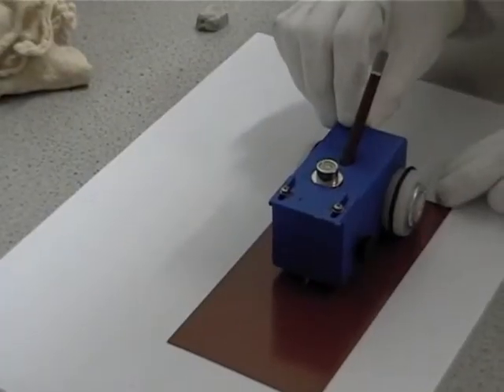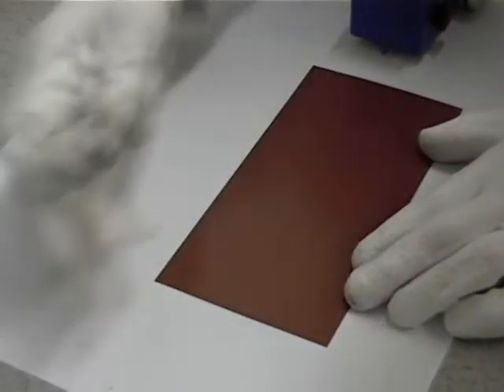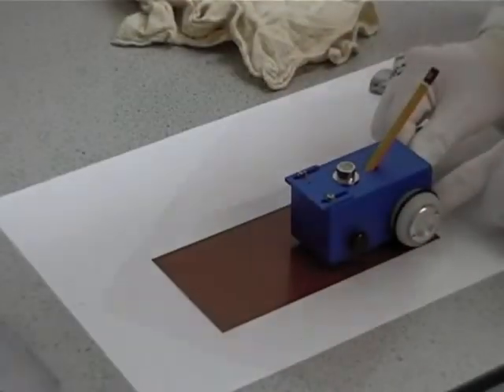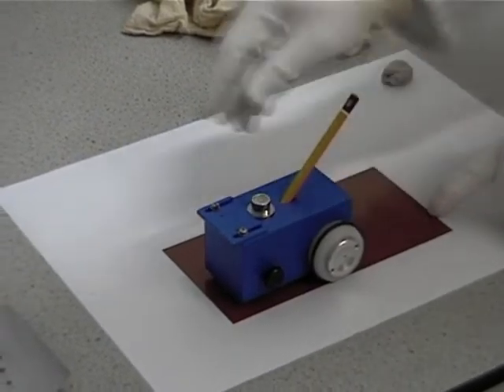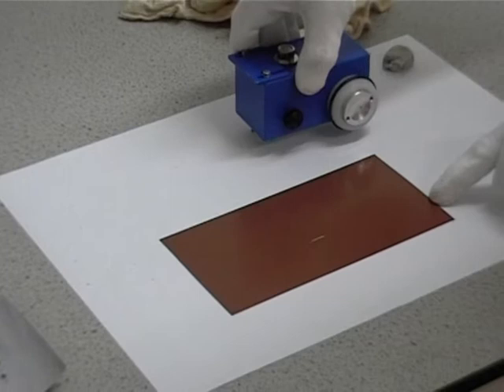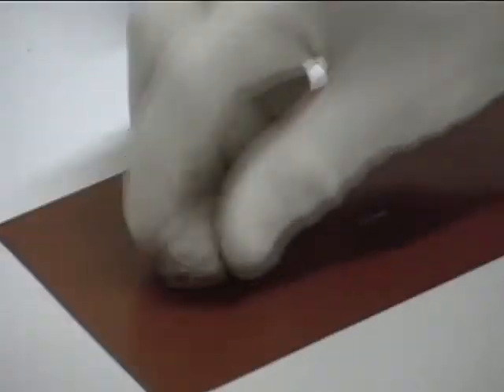The trolley is then pushed with a steady motion and the sample inspected for scratches. Again, in this case, the 3H pencil left no mark, but the 4H made a clear scratch. The pencil hardness is quoted as the hardest pencil which does not leave a mark, so in this case, 3H.